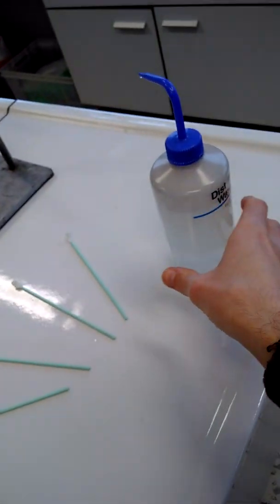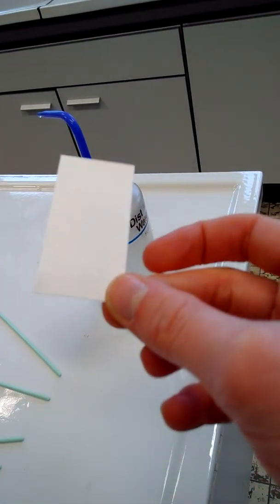But now, maybe more interesting, there's another question to do the same, but do that with a wet filter pad. Over here, this is some distilled water. So what I can do is I can just wet this. I need to place the camera down for a moment, but I'm still there. Sorry. And then, there we go. So now I added some distilled water to this. And again, try to measure this.